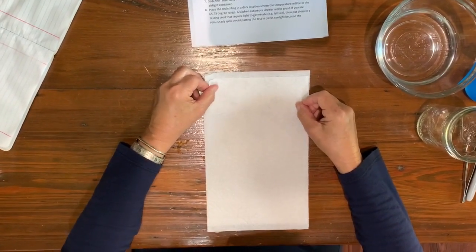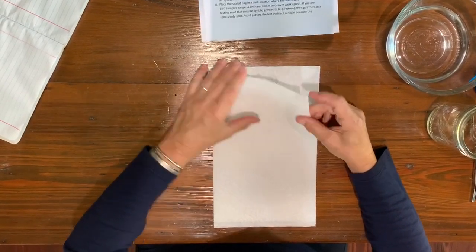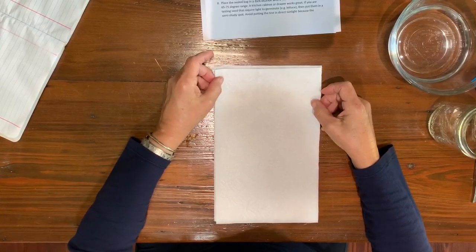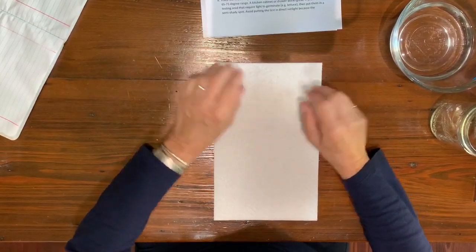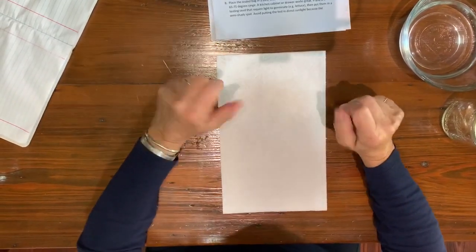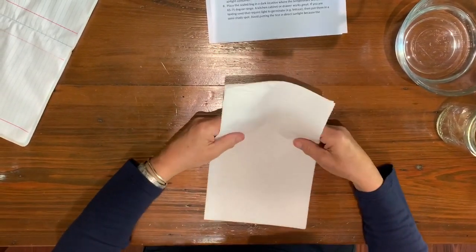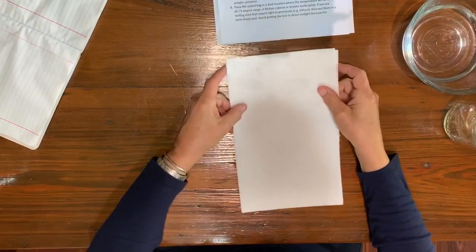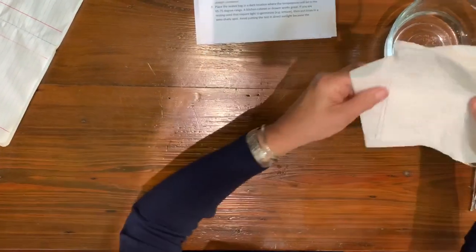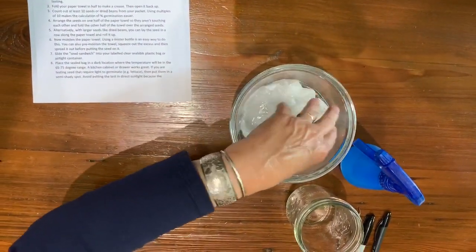Here's an alternative method. I'm going to use peas — they're a little bit larger seeds. I want to make sure they have plenty of water, so I'm going to use a double layer of paper towel and make what in horticulture class we call a ragdoll. We're going to wet this before we put the seeds on it, so I'm putting it in a water bowl to get it nice and soaked.